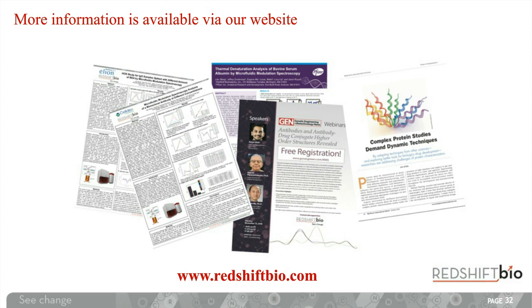We are simply looking at structural change. This may be perhaps due to some stress conditions that are applied to a sample to assess its stability. You might want to study the structure of your protein samples in different formulation conditions, so you could use this in formulation studies. You could use the similarity analysis to give you numerical comparisons between batches, perhaps, in manufacturing.